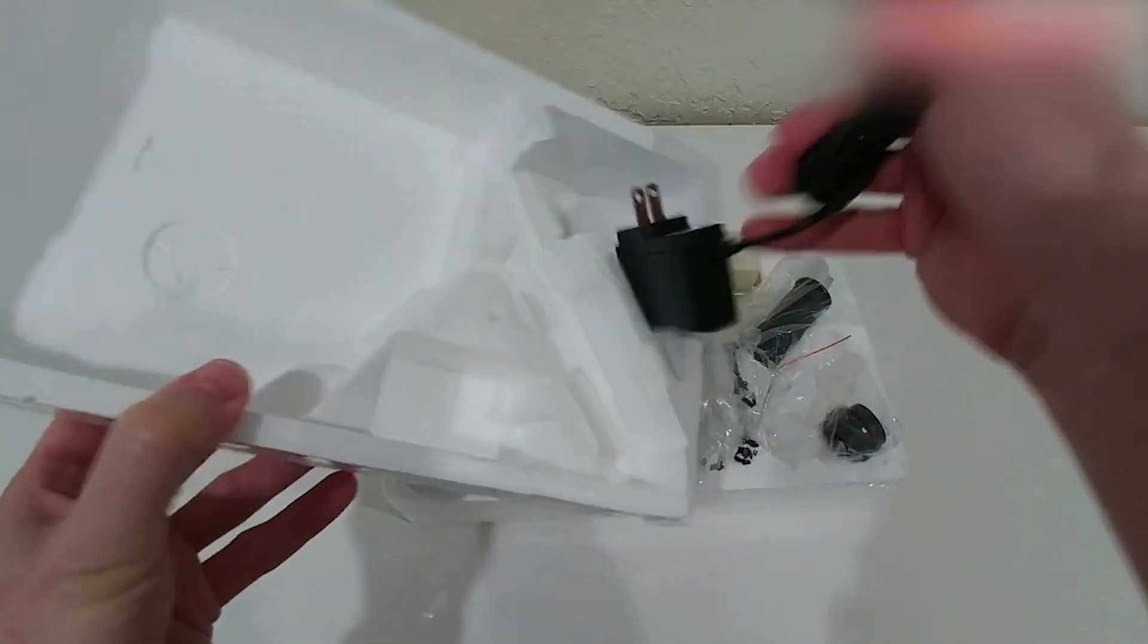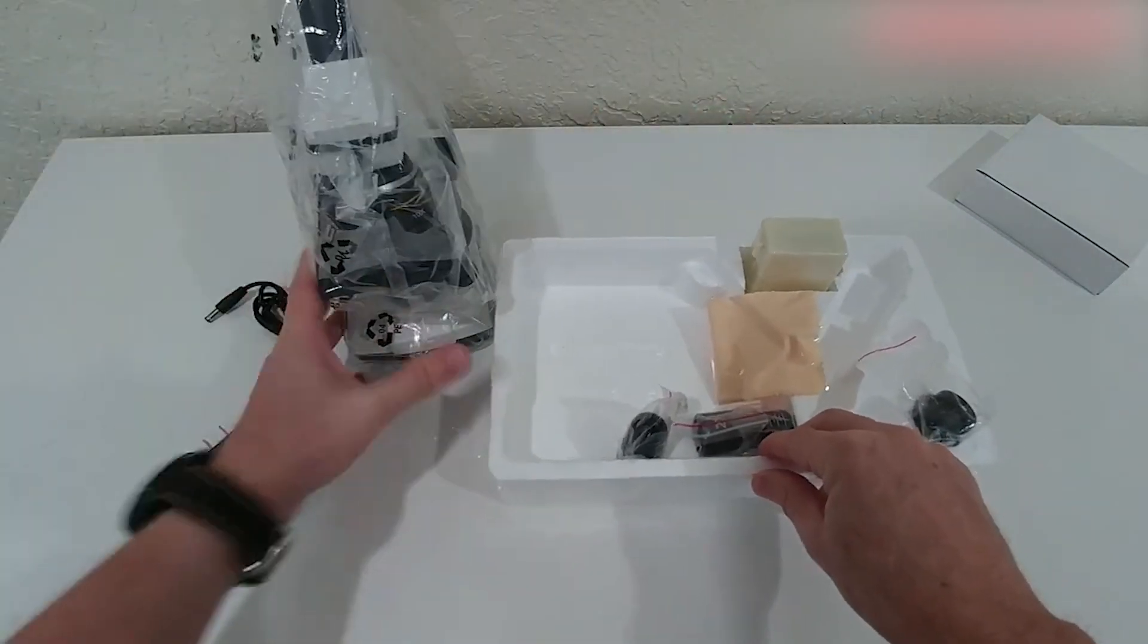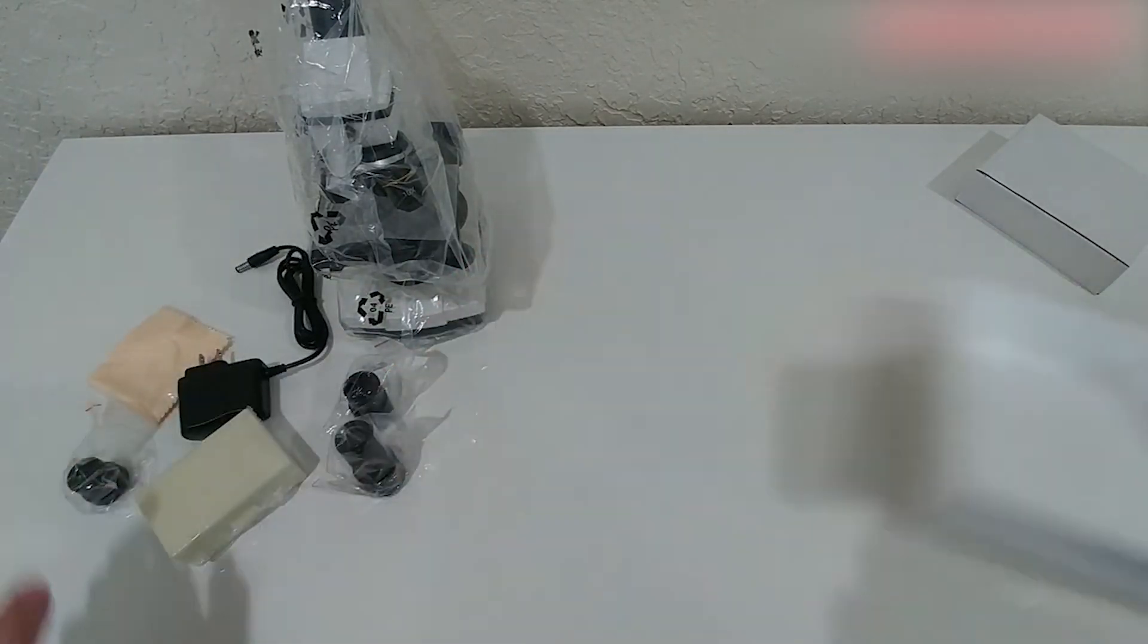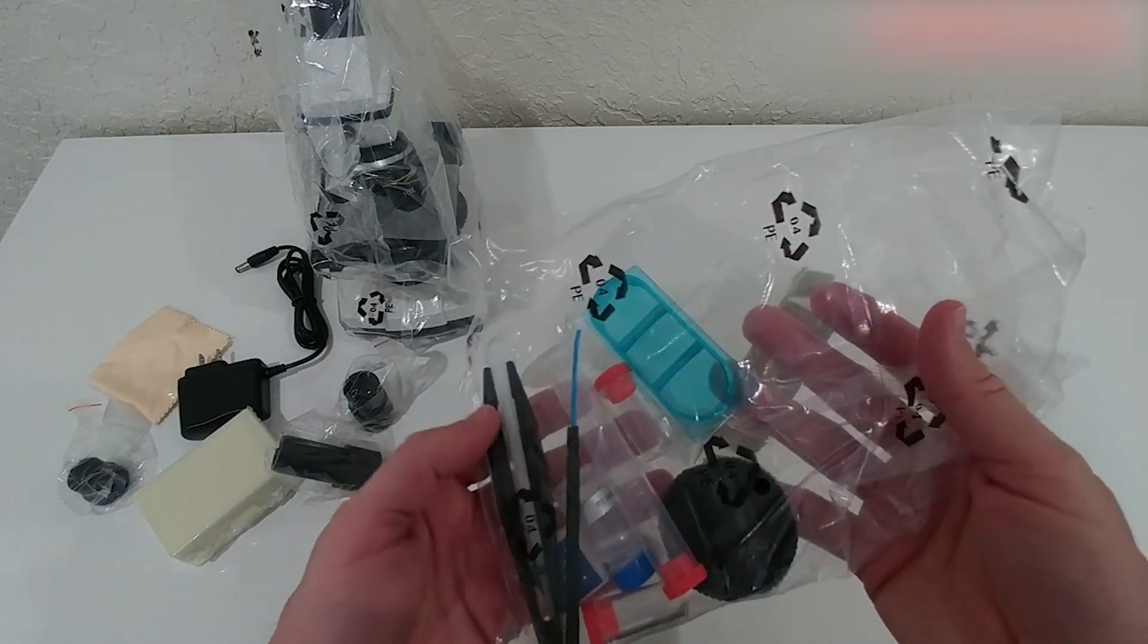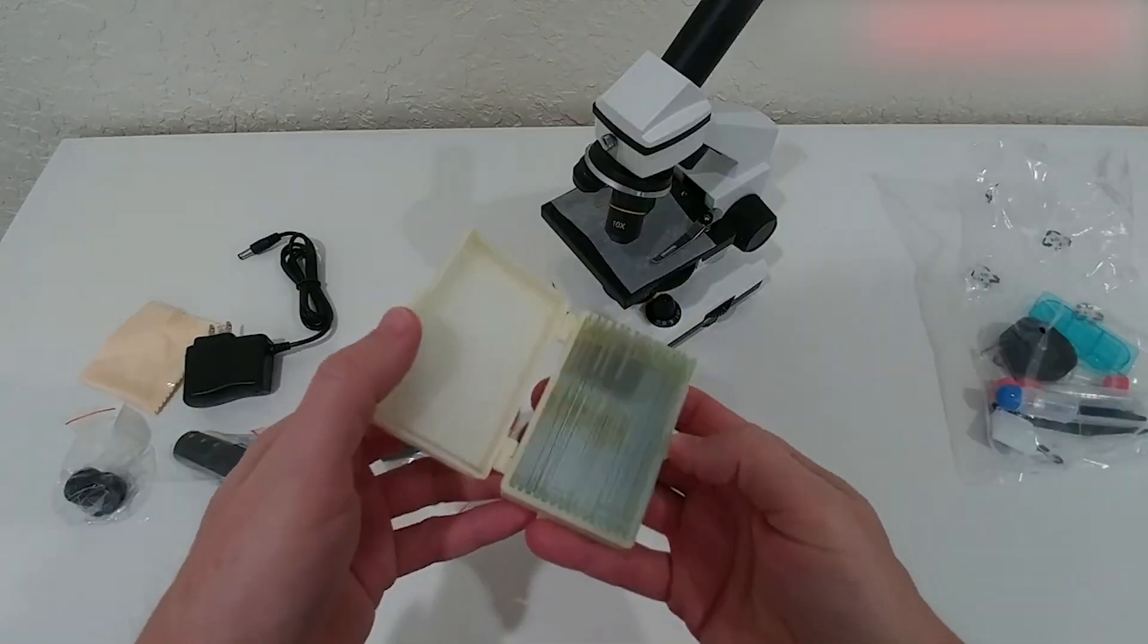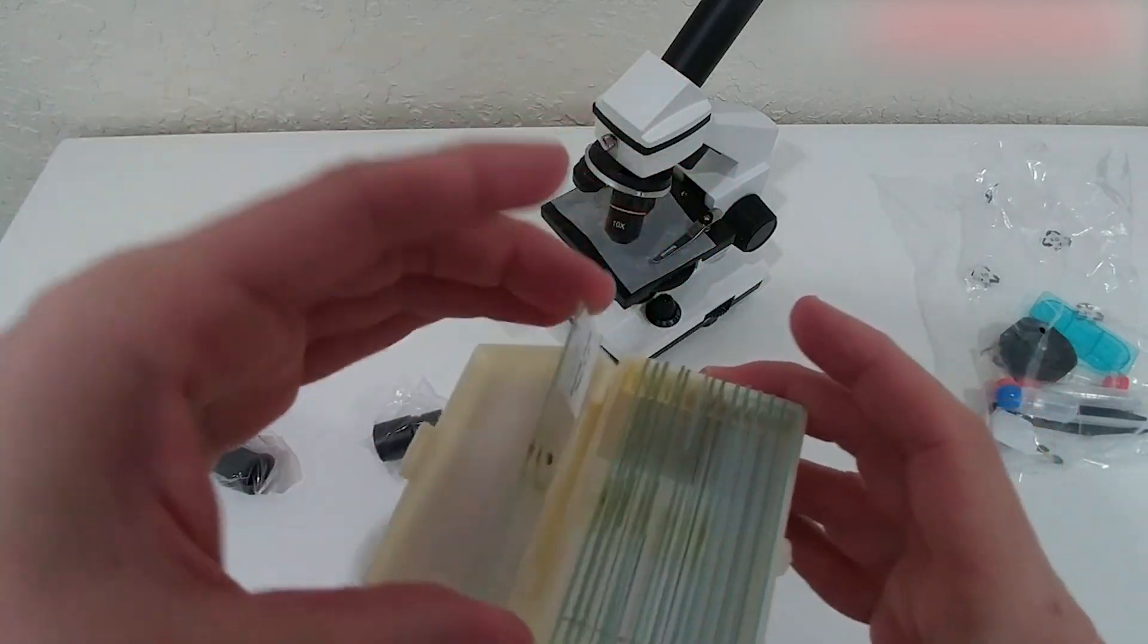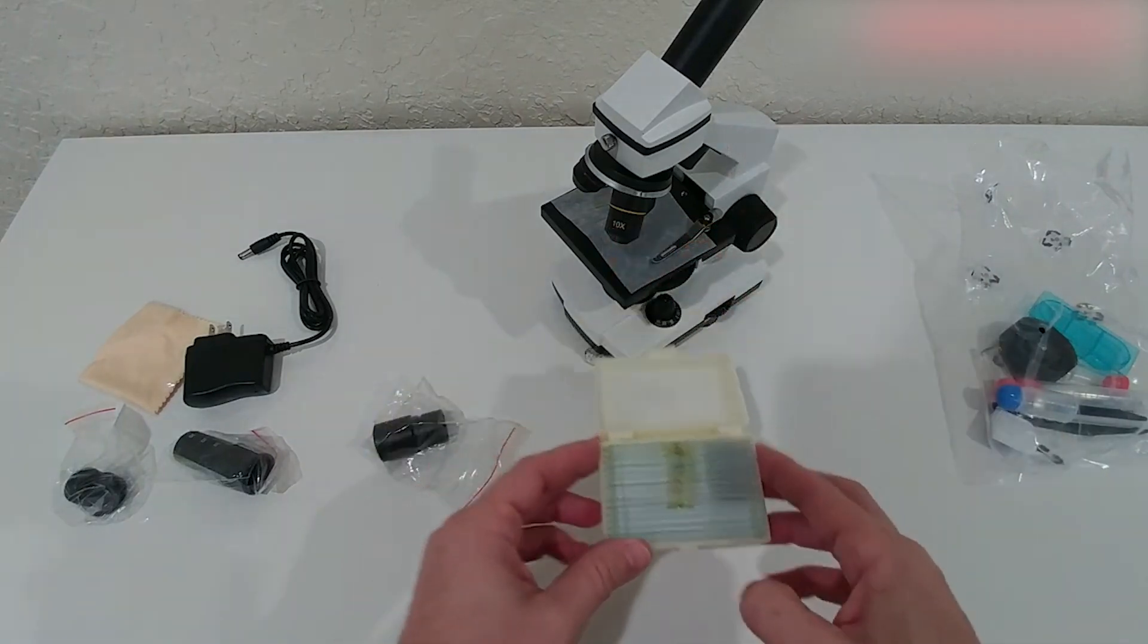One of the standout features of this monocular microscope is its sturdy design. It comes equipped with a solid metal frame that ensures durability, along with both coarse and fine focusing knobs. This thoughtful design allows you to make fine adjustments easily, providing you with precise control over the focus. As a result, you'll achieve sharper, clearer images every time you look through the lens. Whether you're observing a tiny insect wing or the intricate structure of a leaf, you can trust this microscope to help you zoom in on those fascinating microscopic details with confidence.